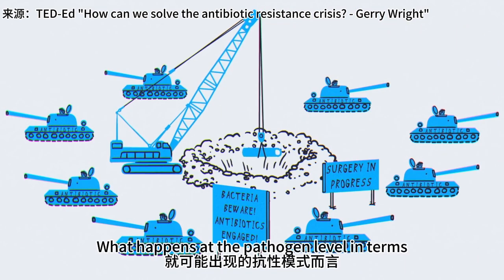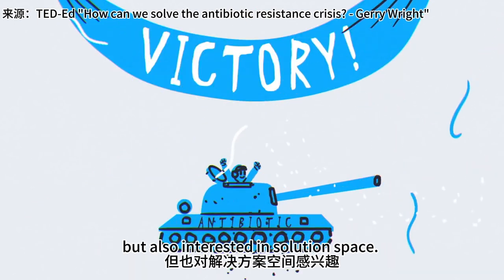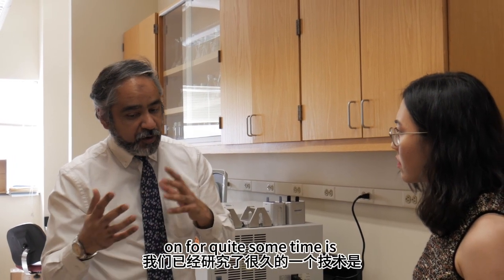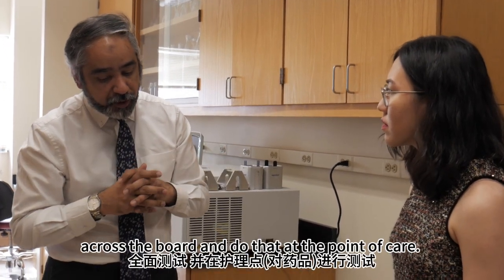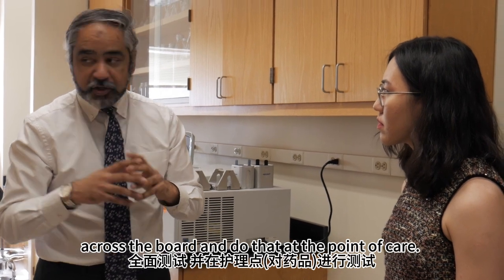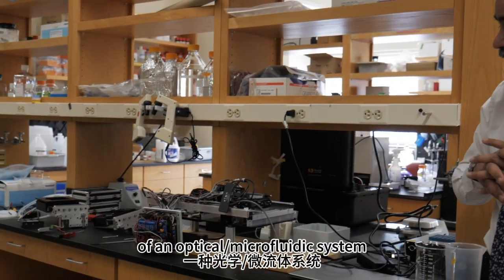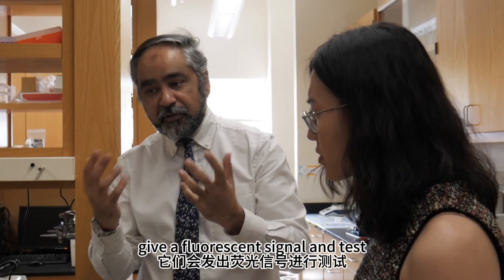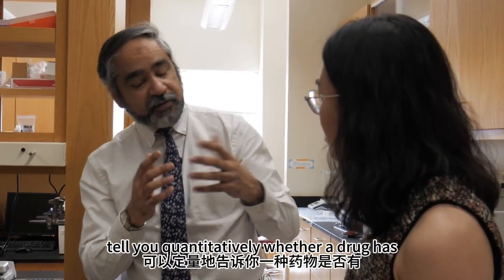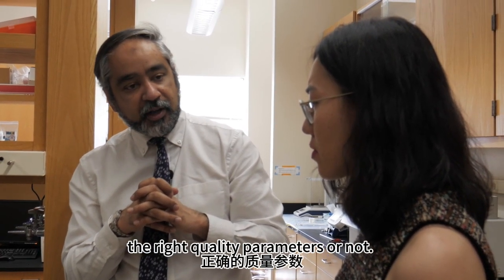What happens at the pathogen level in terms of the resistance patterns that may emerge, but we are also interested in the solution space. One of the technologies that we've been working on for quite some time is being able to test the quality of medicines across the board, and do that at the point of care. So a technology, PharmaChk, and you see the guts of that device here, which is an optical/microfluidic system where somebody can just put in the drug and the system takes care of it. We have the aptamers and the molecules that would bind, give a fluorescent signal, and tell you quantitatively whether a drug has the right quality parameters or not.